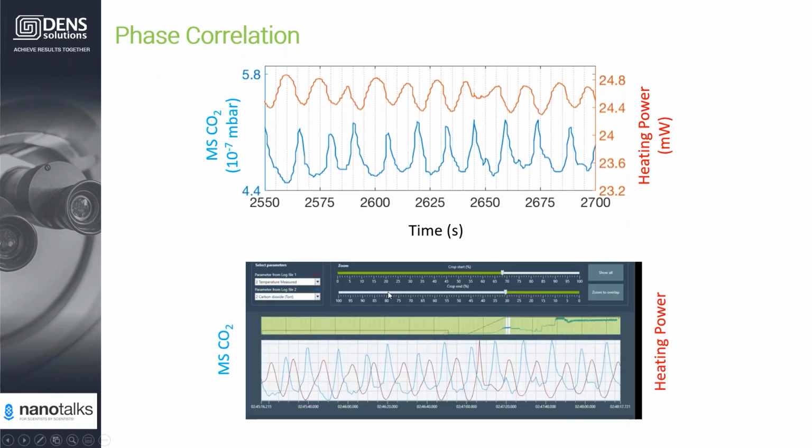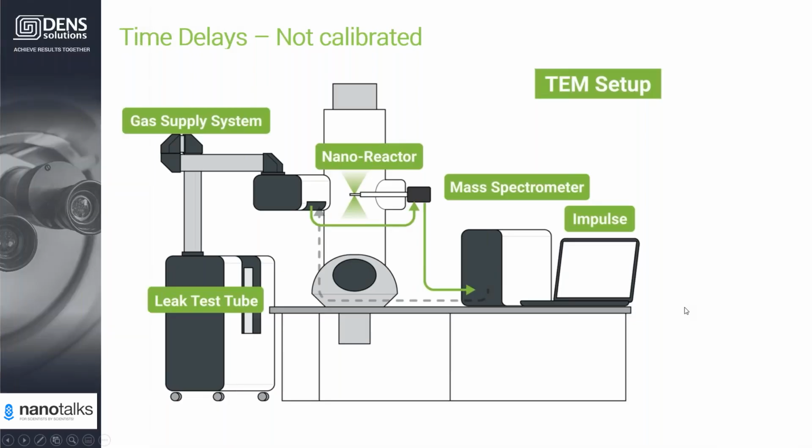But is this what you get directly from the acquisition? From here you can see this kind of antiphase relationship in the final result, where I already did all the data processing and delivered it to you. Is the initial status also like this? No. Actually, you can see here the phase is a little bit messed up. What happened there? Let's look at the gas path again.